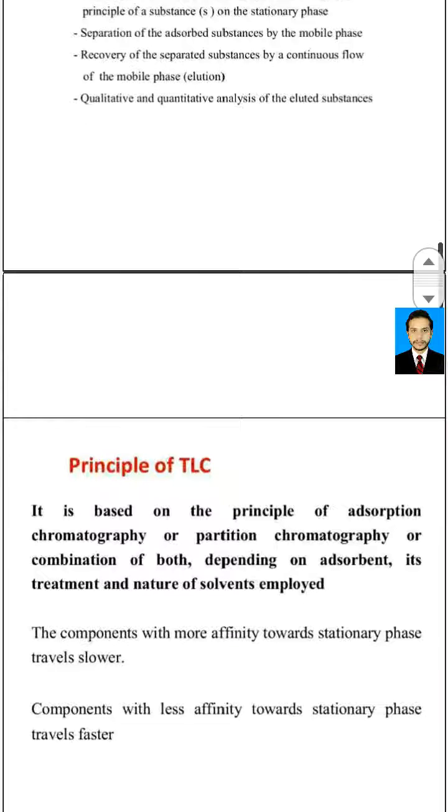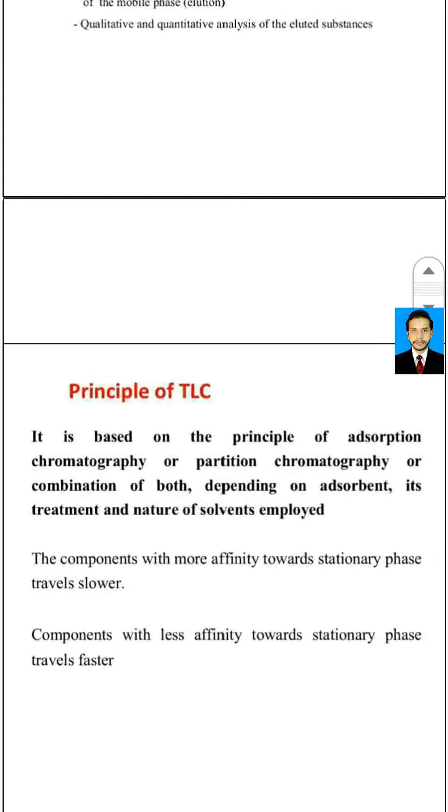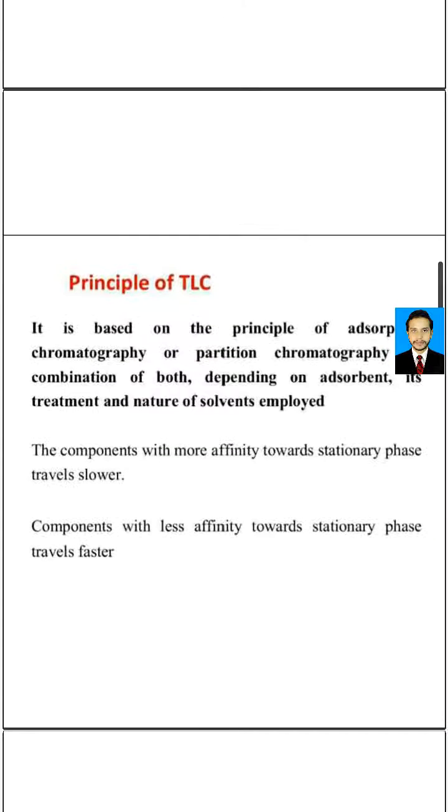Now let us talk about the principle of TLC. It is based on the principle of adsorption chromatography or partition chromatography. Adsorption, as we have already talked about, is where the stationary phase is solid, and partition is where the stationary phase is liquid, or a combination of both depending on the adsorbent, its treatment and the nature of the solvent employed. The components with more affinity towards the stationary phase travel slowly, and components with less affinity towards the stationary phase travel fast.